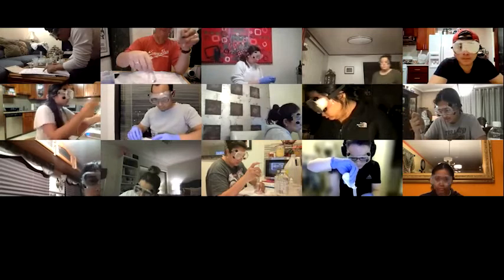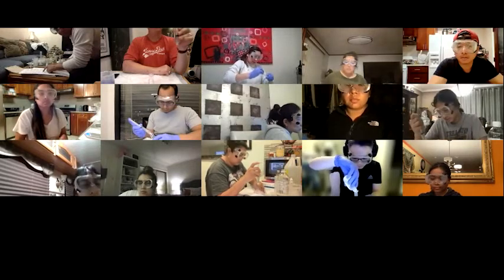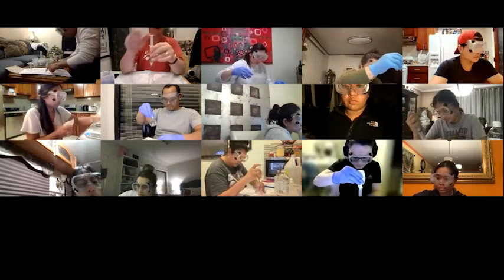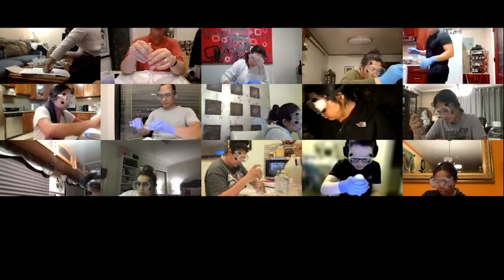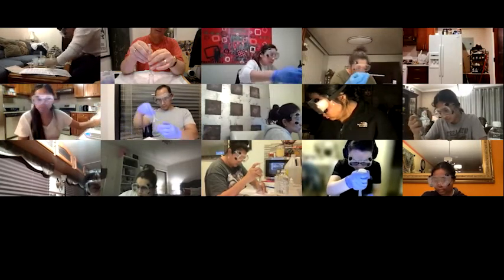What are we using for vinegar sample 2 and 3 again? Oh, same one. So you use this, basically we're doing these in triplicate. And then you get a new sample and do that one in triplicate as well. So the second titration, you can go a little bit faster since you pretty much know what the volume should be. But the first one should take you the longest time.